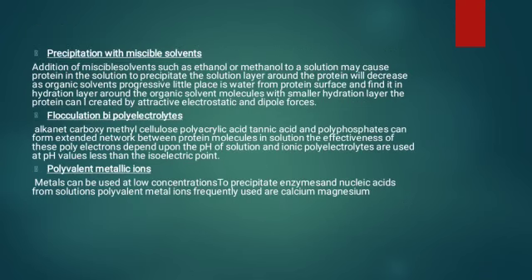Next, precipitation with miscible solvent. Addition of miscible solvents such as ethanol or methanol to a solution may cause protein in the solution to precipitate. The solvation layer around the protein will decrease as organic solvents progressively replace water from the protein surface.